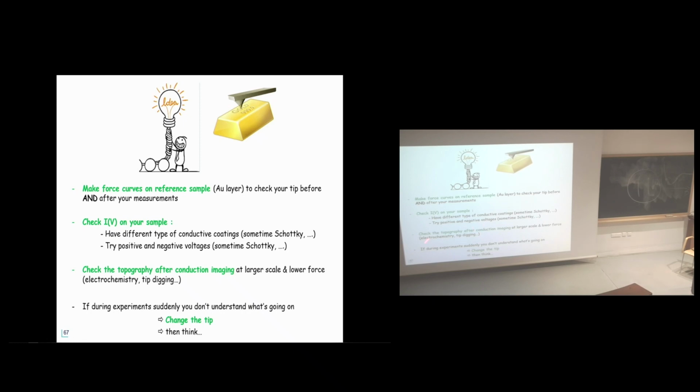Check the topography after your conduction imaging, as I showed you. And if during the experiment you don't understand what's going on, change the tip again. If it remains the same, then start to think a little bit about your experiment, what's going on.